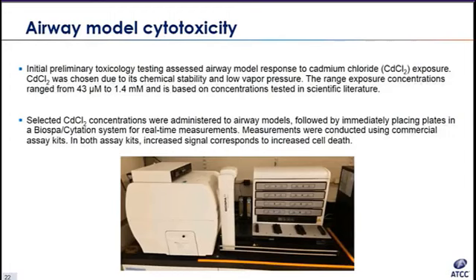In these studies, selected cadmium chloride concentrations were administered to the apical side of our airway models, followed by the immediate placement of these plates in a BioSpa incubation system, shown here, for real-time measurements. Measurements of viability changes were conducted using commercially available assay kits. In both assays, increased signaling corresponds to increased cell death.